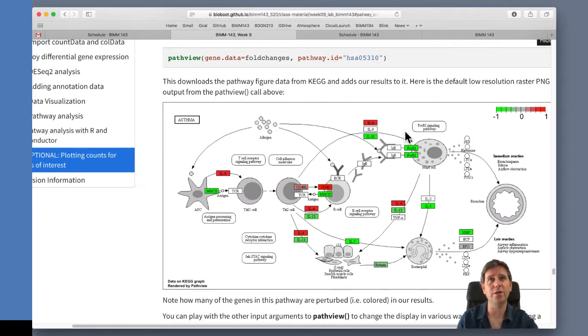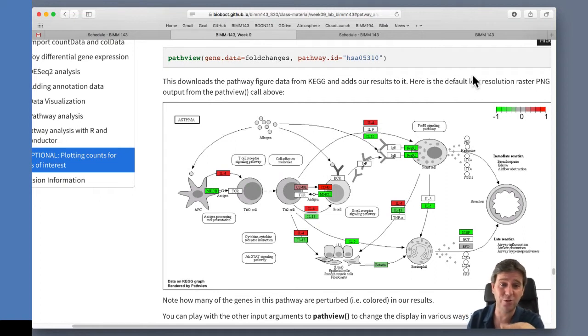So I realize I'm 10 minutes over time here in our 2-hour session, and we might have a 3-hour time window here. I'm going to call it quits here for now for the formal required part. The last little bit, I'll just finish and do this pathway analysis and show you how to include a figure in your document if you're so motivated. But the formal part that you have to upload to Gradescope, once you have your volcano plot and you've answered those first 10 questions in your workbook, we're good to go.